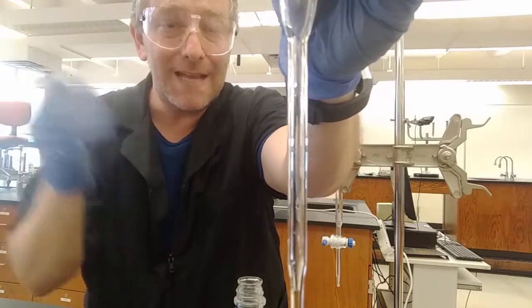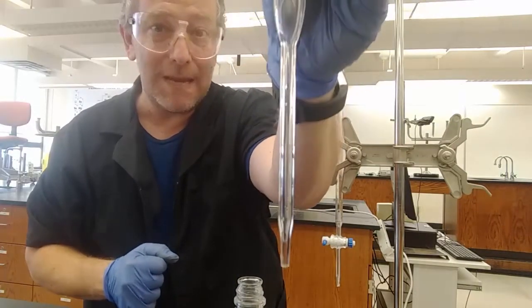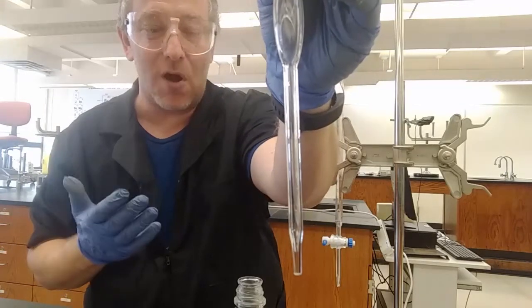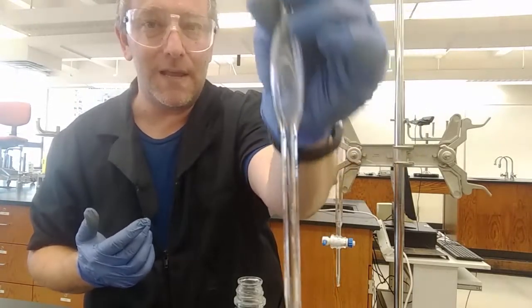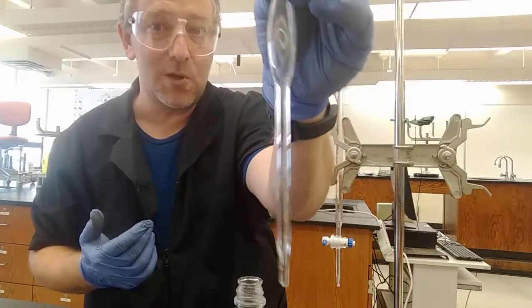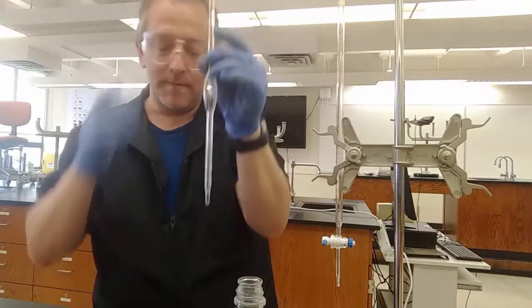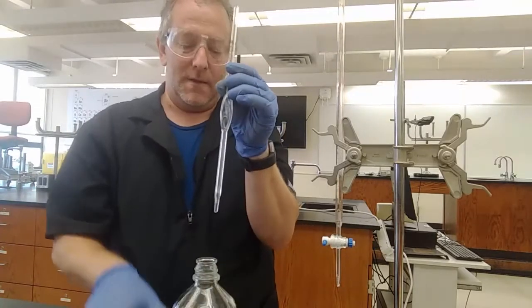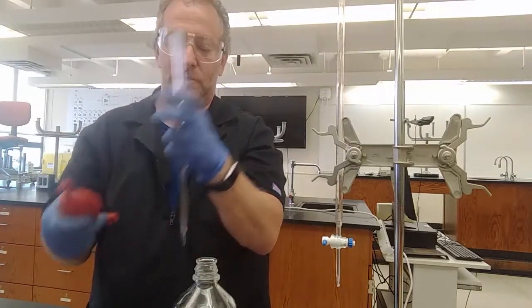However, it's a nice way of us explaining any error that we get at the end of the lab, so I'm going to keep using it, okay? You want to look for opportunities where things that have gone wrong in the lab can be explained. We haven't delivered exactly 10 milliliters, which is the whole point of using this pipette. It is what it is. So that's flask number one, done. We'll do that again with flasks number two and three.